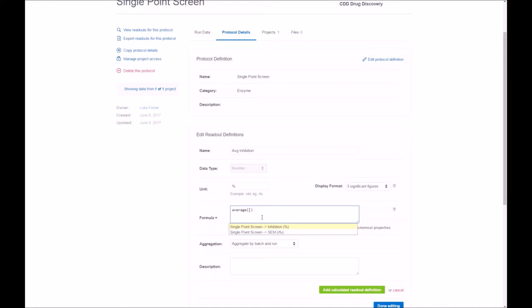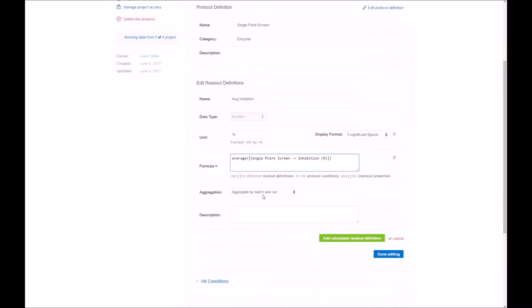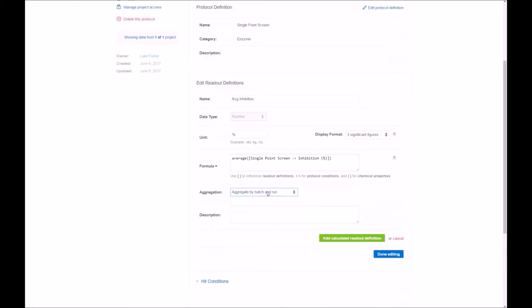You note that we have two options here, the inhibition and SEM, the two that we read in earlier. This is actually an important feature of the formula editor is that this reads not only across this particular readout, but across all projects and all runs. So you can do some really great calculations based on your research needs. One very powerful one is the selectivity score, looking at it across multiple runs, for example.